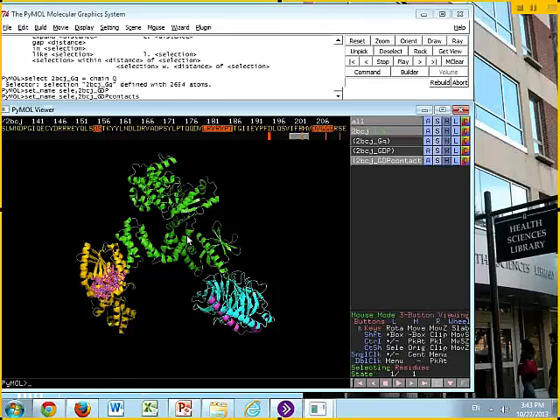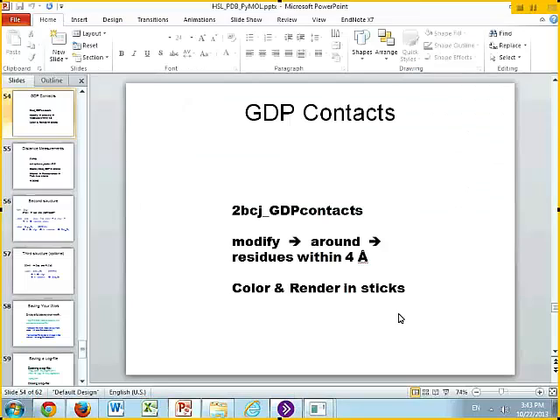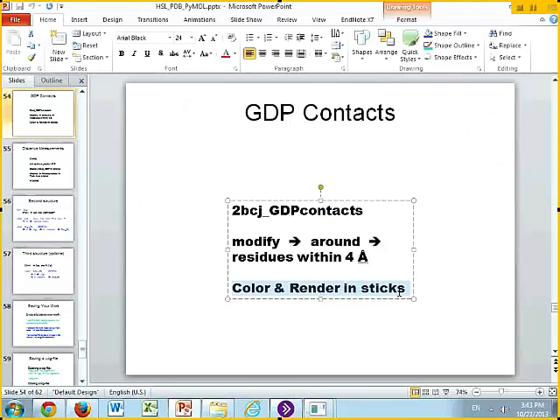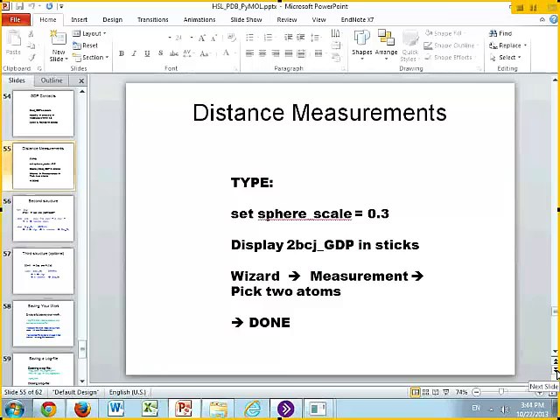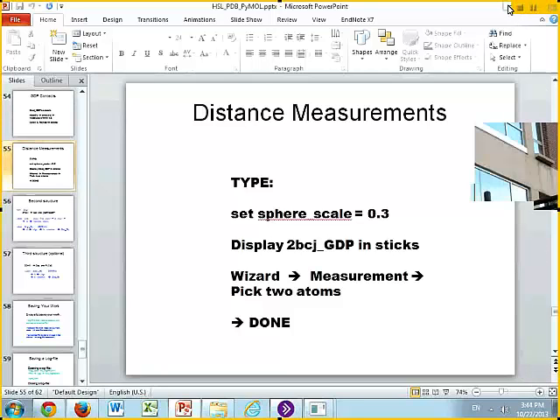A lot of times you may want to zoom in on those residues. In many cases, a researcher will mutate some of those residues that are involved in binding. So you can show what the residue is doing and why mutating that residue affects binding of your ligands. We looked at the GDP contacts. Now we're going to color and render in sticks, which we did.